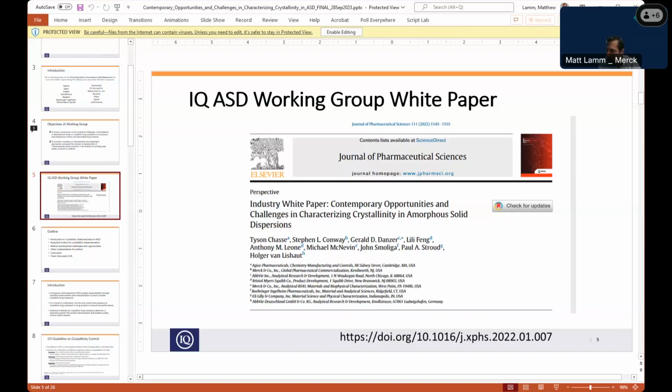Let's see. Frank, given your background in spectroscopy, can you talk about developing chemometric methods with spectroscopic techniques and the challenges or benefits of doing that? Most of the time, the biggest challenge is to actually determine specificity in spectroscopic methods.